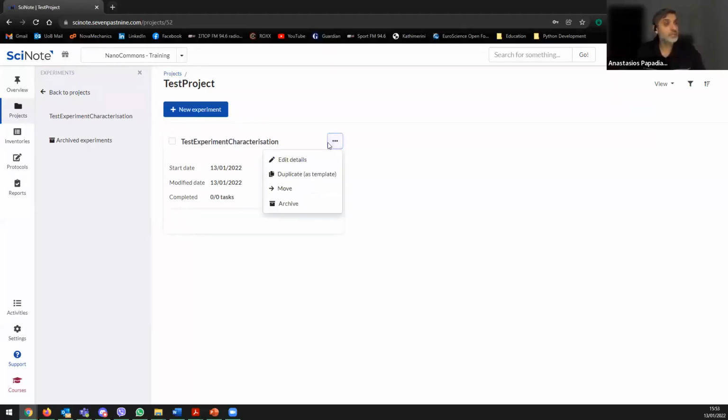Again, now if you clear, again, you can add details. Most importantly, you can create, let's say, model experiments that you can use within your group or your organization or your project. So you create one instance of an experiment, you input everything, and you can then duplicate, and you can move between experiments and projects, etc., as we will see. And you can archive, of course, as always.